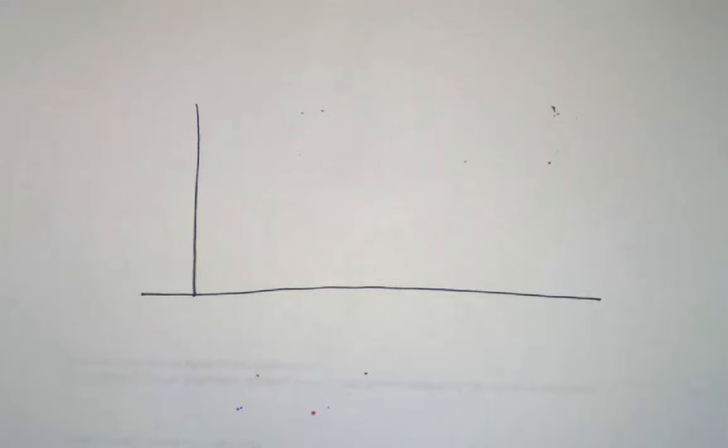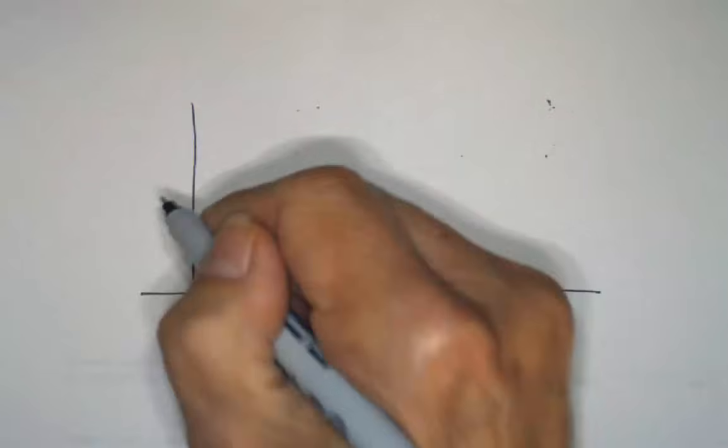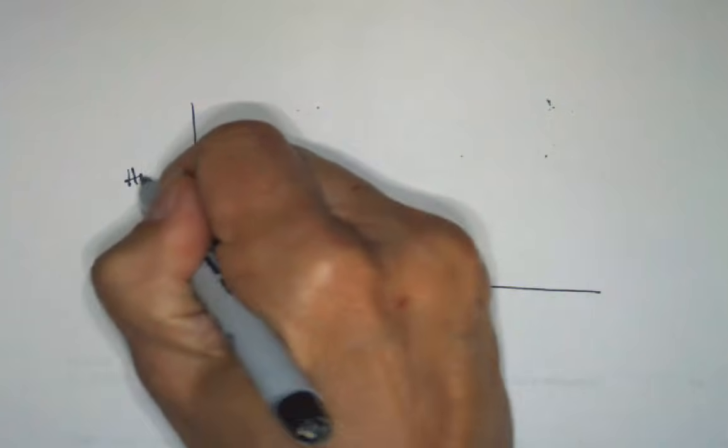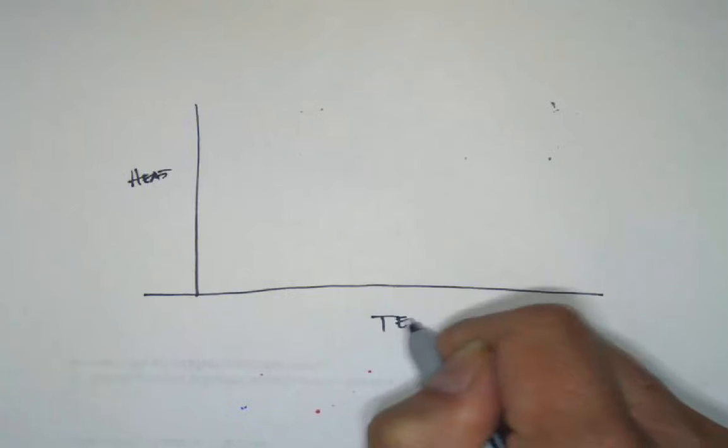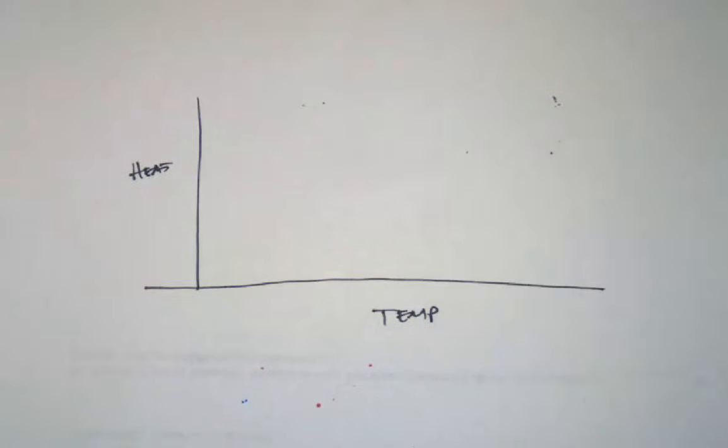So let's talk about an extreme case of this. And the reason we commonly do two runs, students will bring me a DSC curve, and they'll say, oh, I think there's a Tg here, but look at this. The baseline isn't flat. It's all wiggly. There's all kinds of weird stuff going on. And so, again, always heat and temperature. I've been skipping these, but you know they're on every one of these graphs.